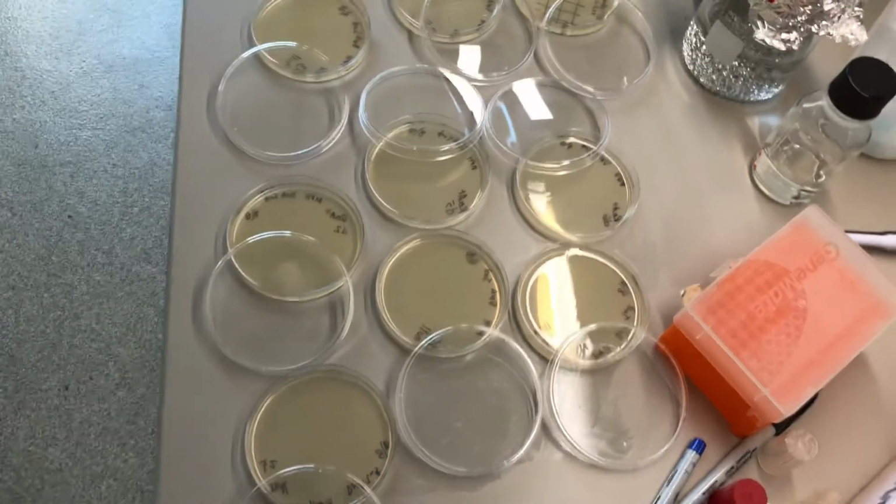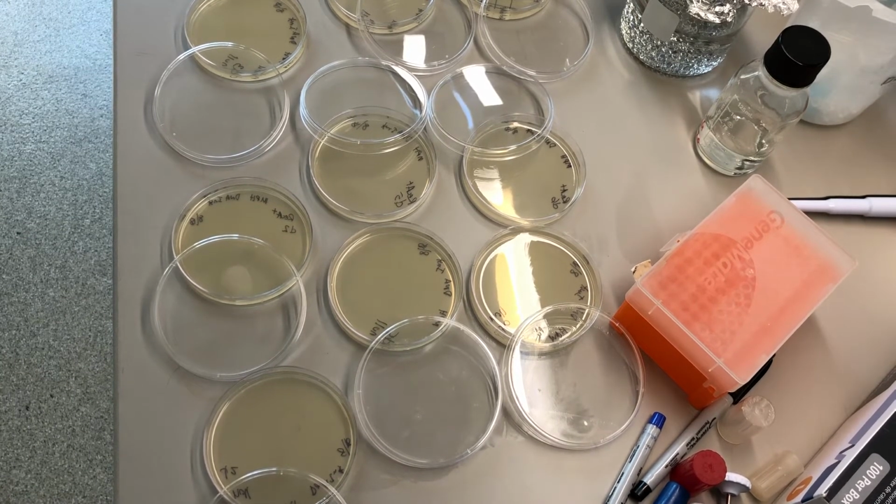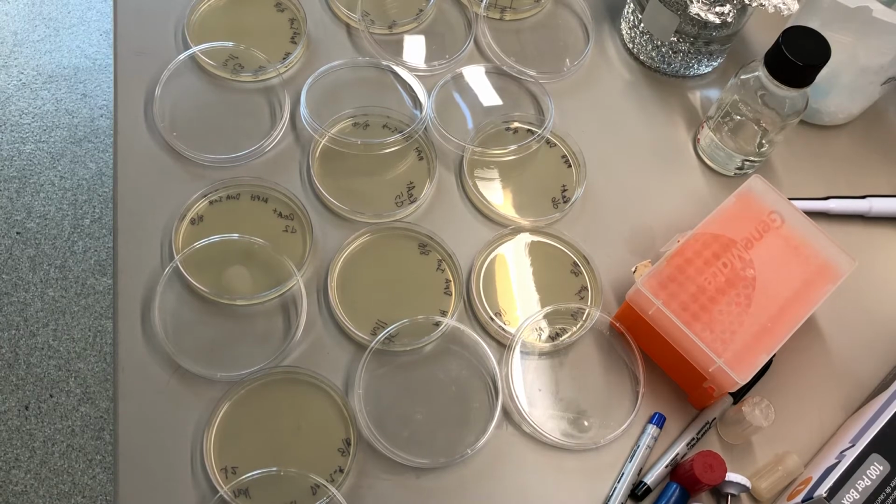Students may not be required to make all of these plates. Right now we're testing what's the target zone for countable numbers of colonies, and the TAs will update you exactly which plates to make. Here I'm making a very large panel of plates, but students may have only half as many plates.